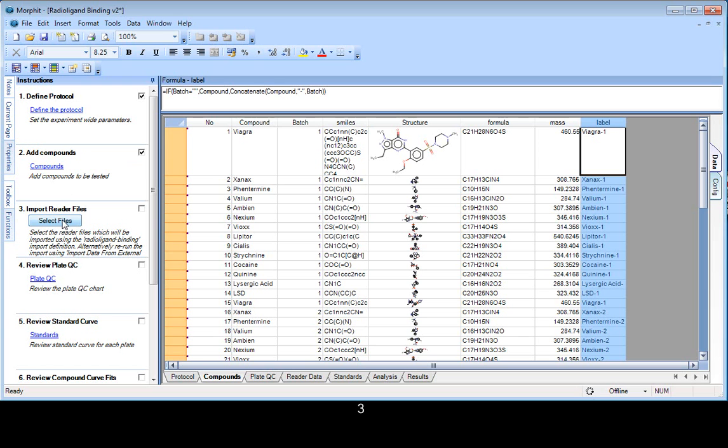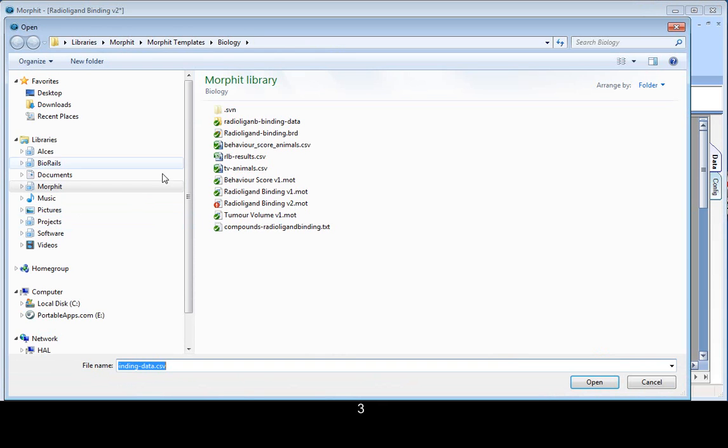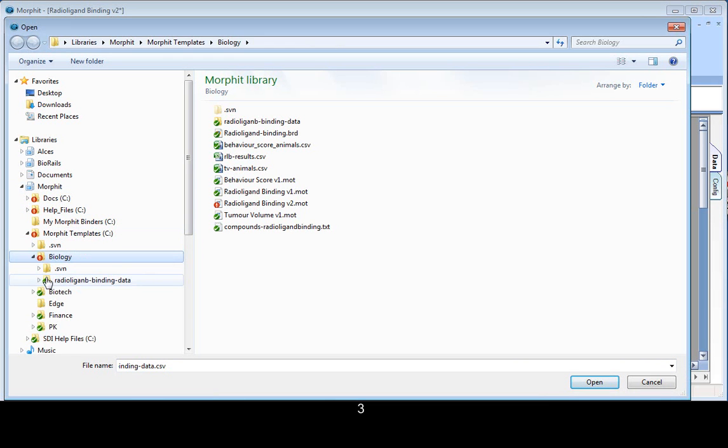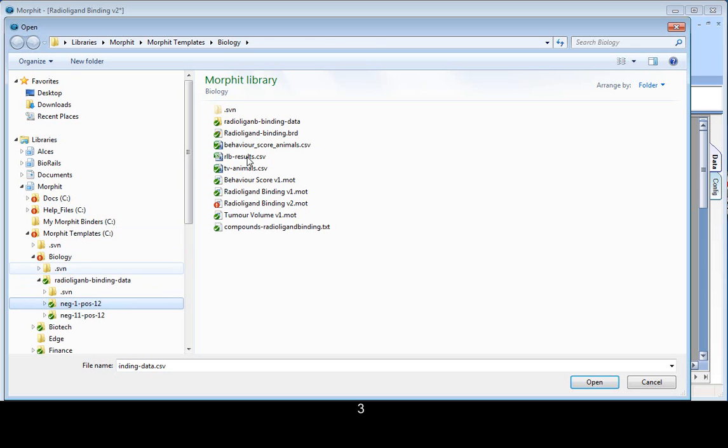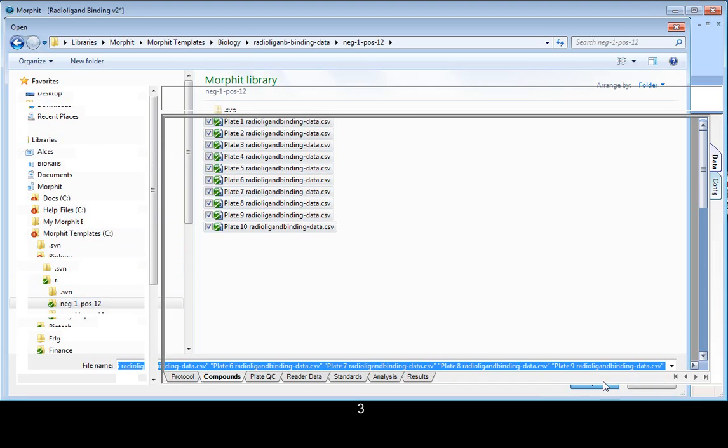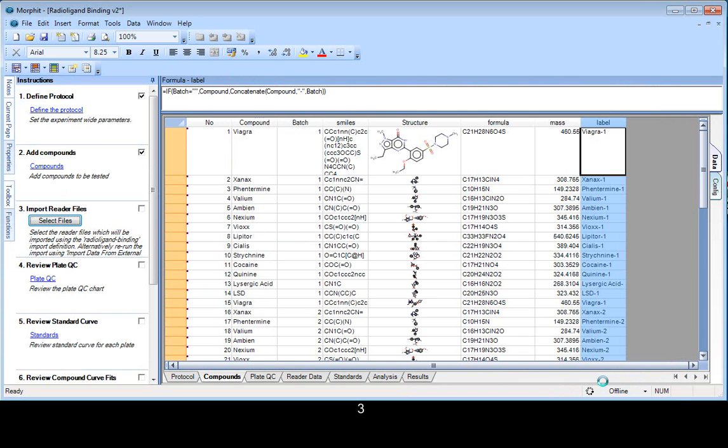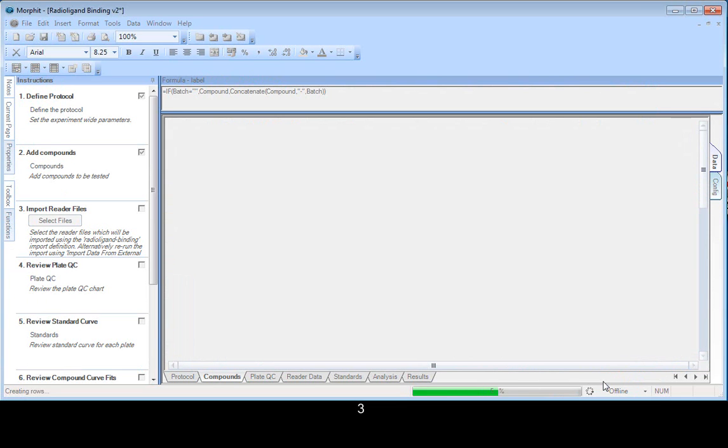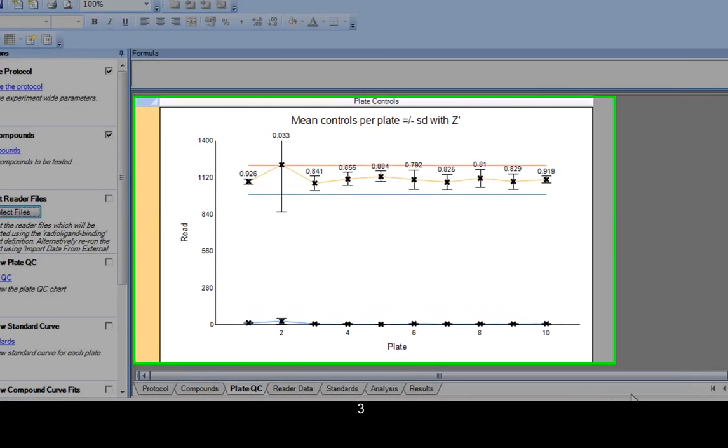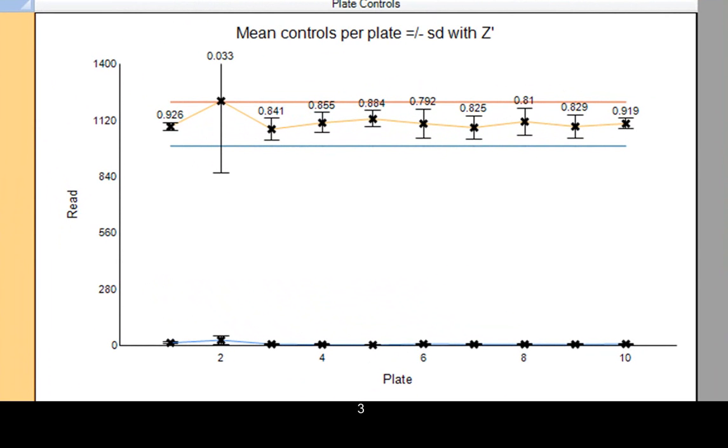The next step is to select the generated reader files. So the data is read in, and because we have a plate format associated with this binder, we can automatically calculate the mean of the controls for the plate and their standard deviation and the Z primes. And this gives us an overview of the quality of the run. The tram lines in the middle of the graph are calculated from the acceptable positive control. And we can see here in the second plate, we have a bit of a problem.